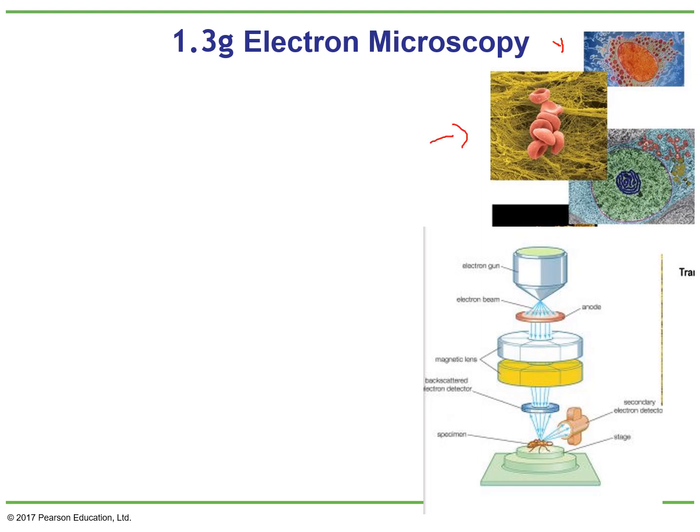As I said before, unfortunately, you don't have colors. You create this color with software that makes the pictures easier for you. When you know your sample very well, you can help other people to understand better what they are supposed to be observing, like here and here. So later in the course, I will show you how there are multiple software packages to do that.